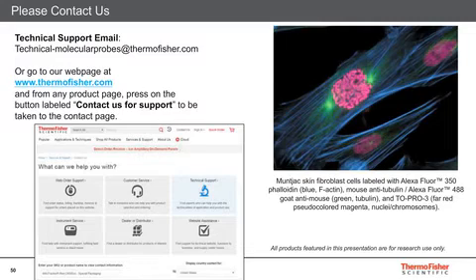For instance, sometimes people will use Trolox in solutions or N-propyl gallate, or Dabco, but I'm here to tell you they're not nearly as good as what we have optimized. I would definitely recommend going with a commercial anti-fade mounting medium like our Prolong and Slow Fade products, because we've done so much validation with a wide range of different dyes and techniques.